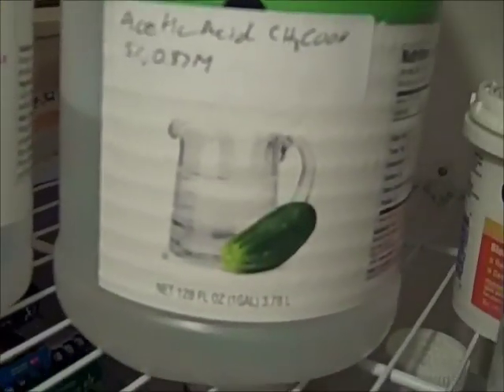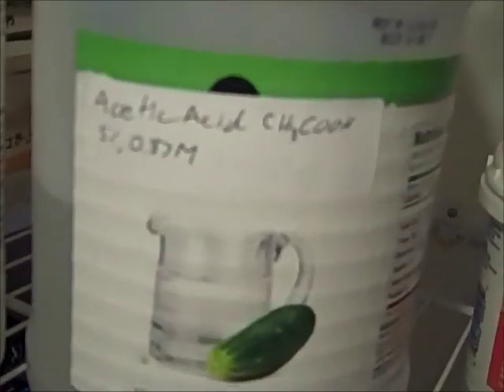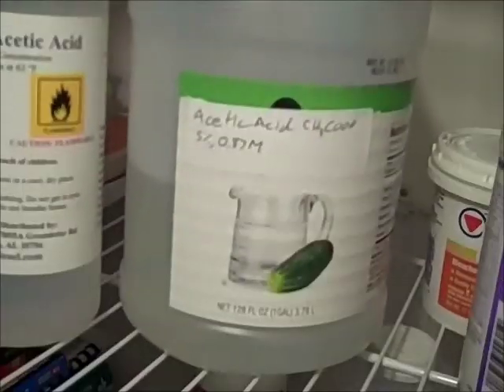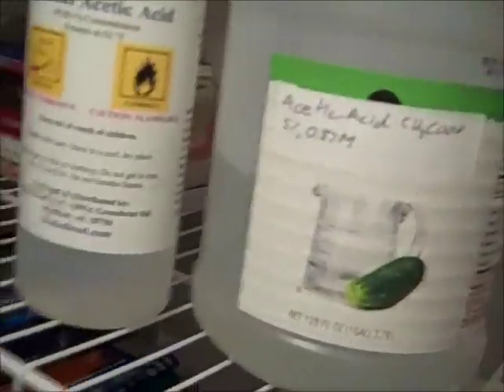Alright, next is vinegar. Here is typical supermarket vinegar. This is around 5%, which would correspond to 0.87 molar, but I have yet to titrate this stuff to confirm that. It's not really good enough for most purposes unless you need to neutralize a base spill or do a volcano demonstration, but it is worth mentioning. You can get this at almost any supermarket.